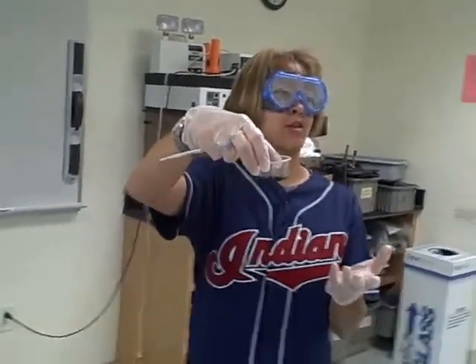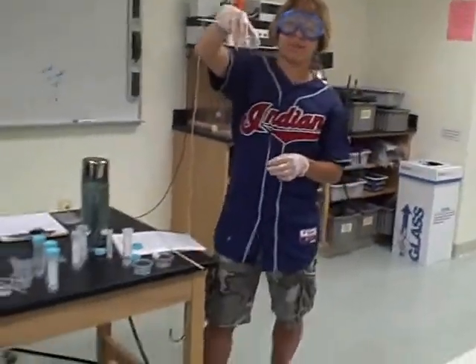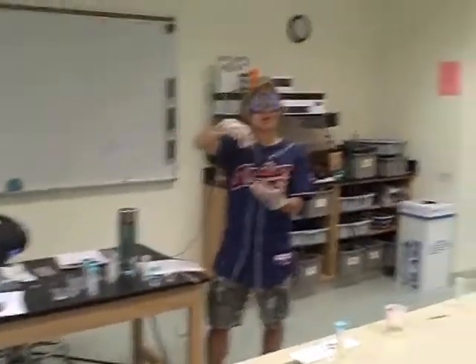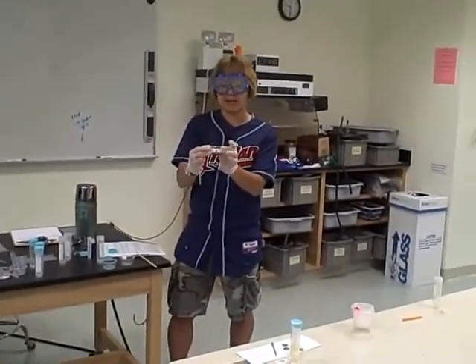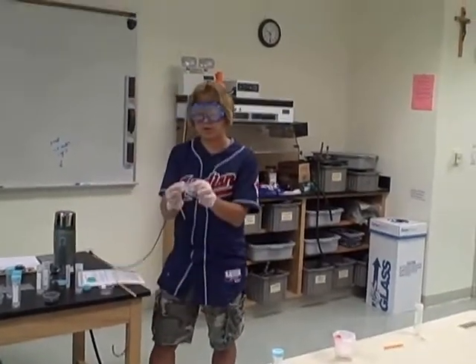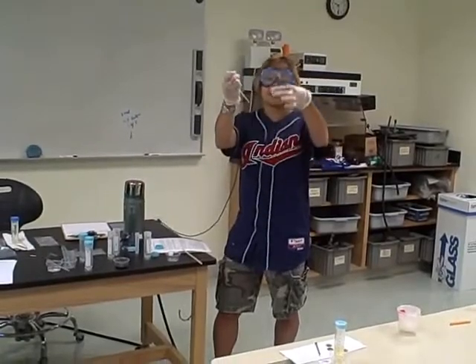Originally, this is why we had the larger volume, it would have been more obvious with a bigger amount, but you can tilt it a little bit so that the students can see what's going on. You might start to see a precipitate form. Literally, I only put 2 drops in here, and that was plenty. So you're going to do the same thing with your cup number 12. Probably 1 drop or so.